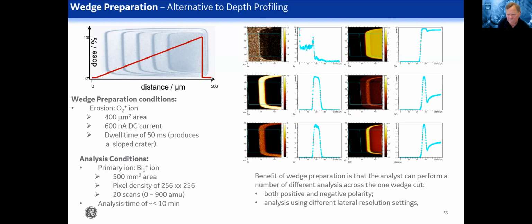So it's not, every sample is different. And as an analyst, you always have to think, what's the right starting technique? What's the right approach? And then be ready to pivot based upon what you learn.